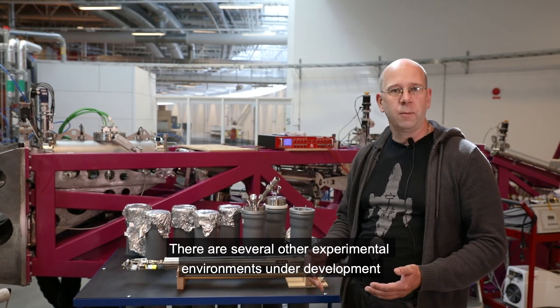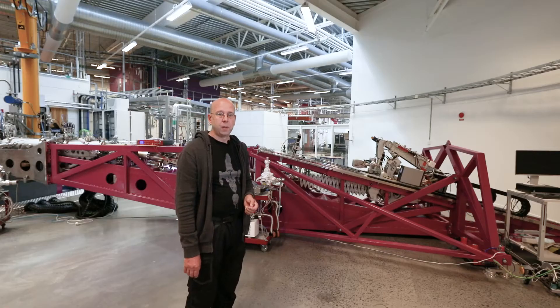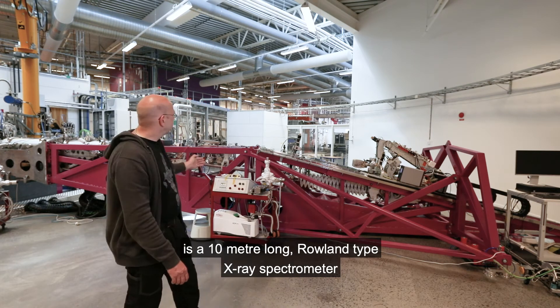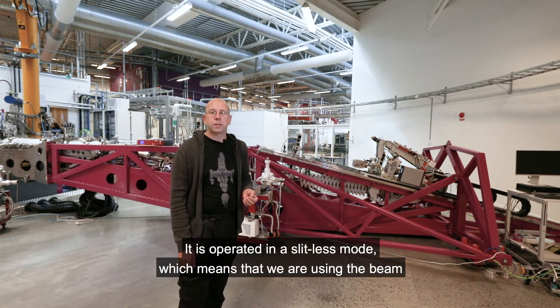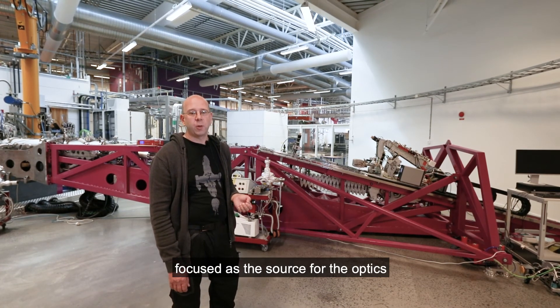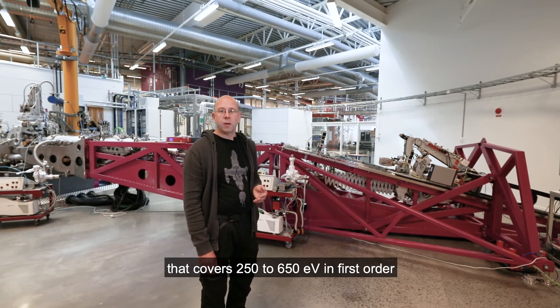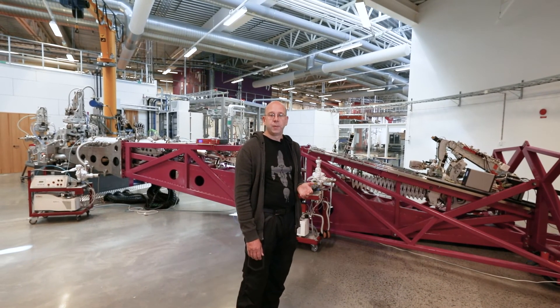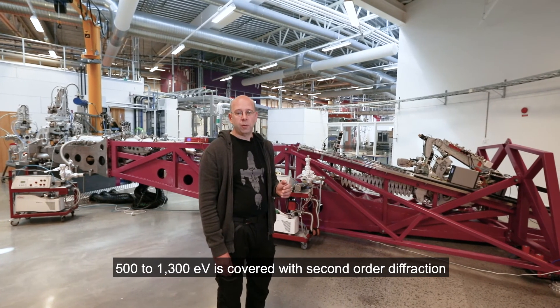There are several other experimental environments under development that will be available in the future. The main instrument here at Veritas is a 10-meter long Rowland-type X-ray spectrometer. It is operated in a slitless mode, which means that we are using the beam focus as the source for the optics. It is currently equipped with a 1200 line per millimeter grating that covers 250 to 650 eV in first order.